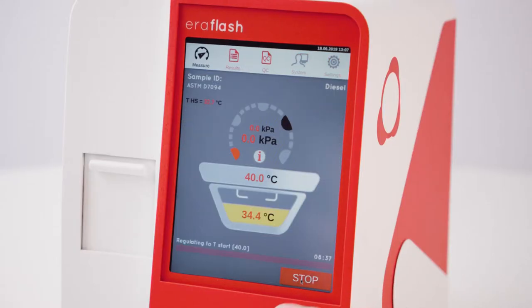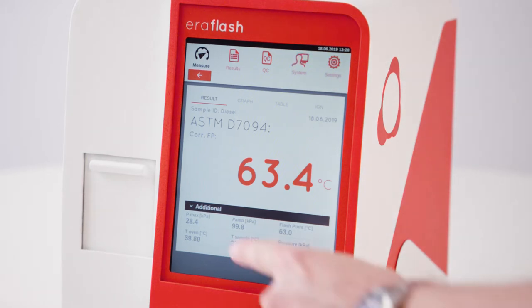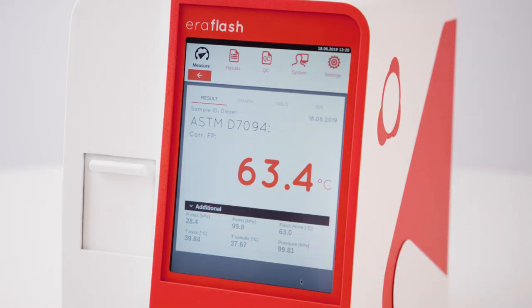Insert the sample cup into the measuring chamber and close the front door. Press Run to start the fully automated measurement. Live sensor readings and an illustration of the progress are displayed on the screen during the measurement. The actual measuring time depends on the applied temperature range and is less than 10 minutes for an ASTM D7094 measurement. After the measurement is completed, the detailed result screen is shown. The flash point is automatically corrected to sea level.